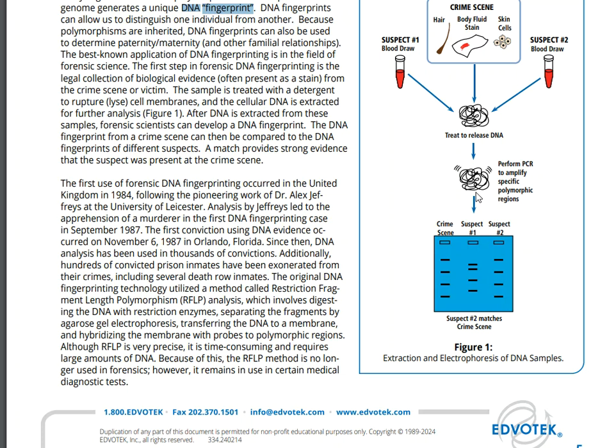And when we start snipping the DNA into the chunks, we are really relying on the polymorphisms of the DNA from the different samples, because each DNA sample will have different areas where that particular base pair assembly is going to show up, and yours will show up in a different spot than mine will, and we start to get different base pair fragments that begin to happen here. So if you look on the gel electrophoresis, which is down here at the bottom, you'll see the crime scene sample has been taken, and then here is suspect number 1.